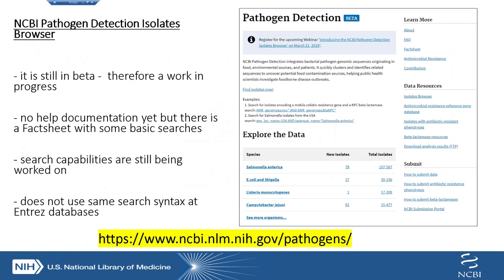This is a screenshot — right after this I'll give you a demo. The Pathogen Detection Isolates Browser is in beta, which means it's a work in progress. We are continually evolving its capabilities. We released it back in 2016 and have been continually adding features. There's no help documentation yet, but there is a fact sheet under 'Learn More' in the upper right menu. We will work on help documentation in the future, and we want to make sure the search is streamlined before documenting it.